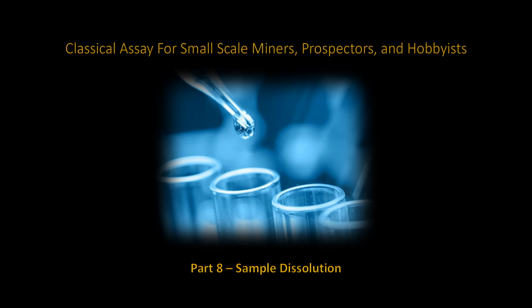In Part 7, I focused on the discussion regarding the most common acids used in chemical assay. Included were the concentrations commonly used and purchased. The more concentrated the acid, the cost is less in the long run, due to diluting the concentrated to the required concentration needed. In this presentation, I want to focus on sample decomposition. There are some important considerations on how this can be achieved.